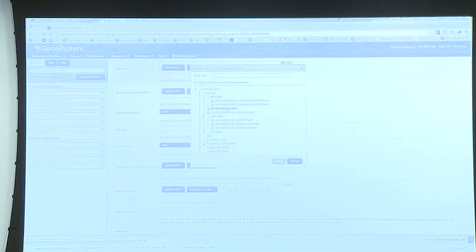And bed is a name of a file format which tells you chromosome, start point, end point. And you can add some other features, but that's the definition of a bed file. So this is the one that you should use, and you shouldn't get bin files for all the chromosomes. If you get that, it probably means that you've used a wrong file for the region bed.